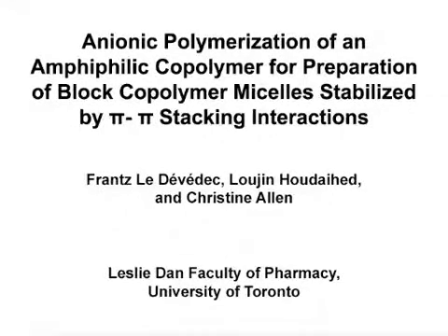The overall goal of this work is to demonstrate the critical steps needed for synthesis of block copolymer materials by ring-opening anionic polymerization and to show the necessary flow of studies for block copolymer micelle formulation of a hydrophobic drug.